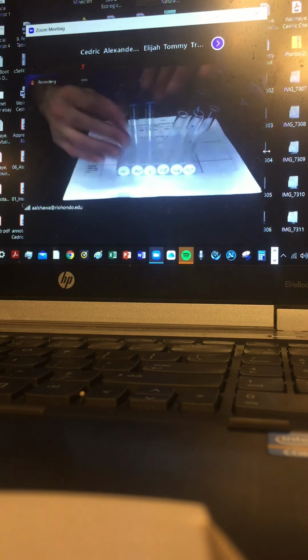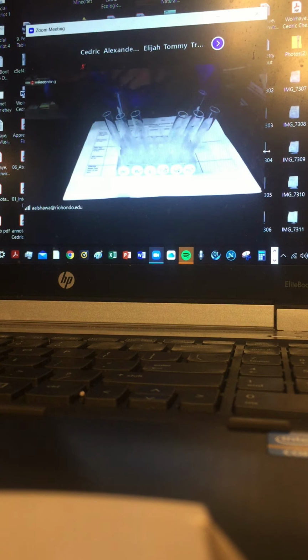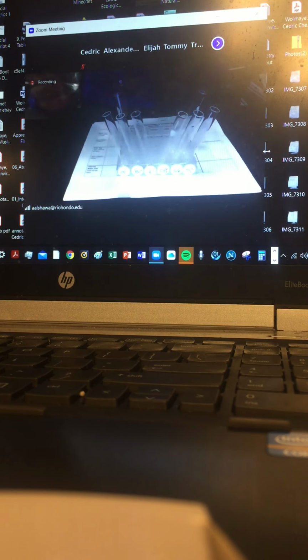All right, I want to acidify, because that test, the barium chloride test, is specifically for the sulfate. So I want to add a harsh acid to complete the test, basically to expose the sulfate polyatomic. So I want to add harsh, high molarity hydrochloric acid. So we've got 6 molar hydrochloric acid. So I want to add a few drops of that 6 molar.